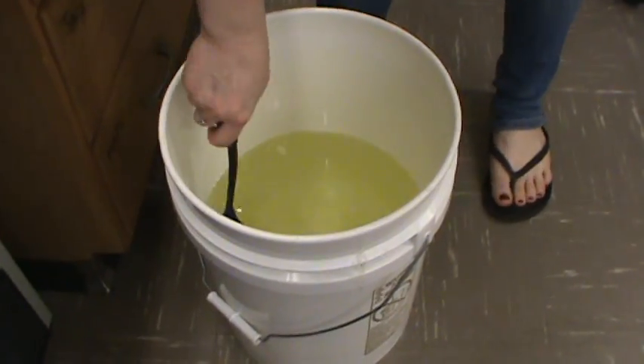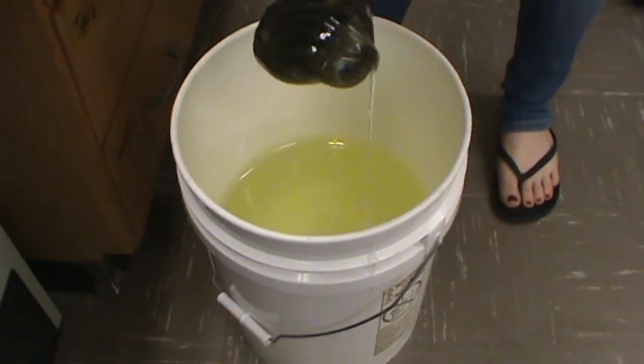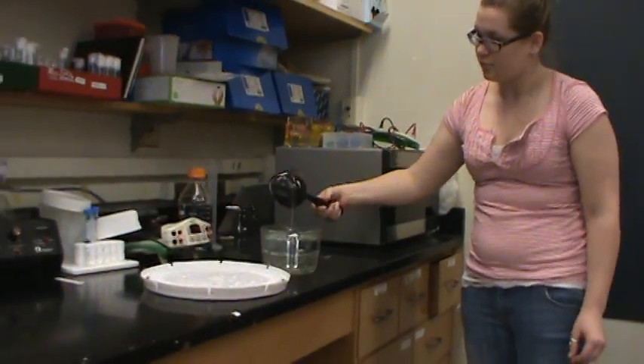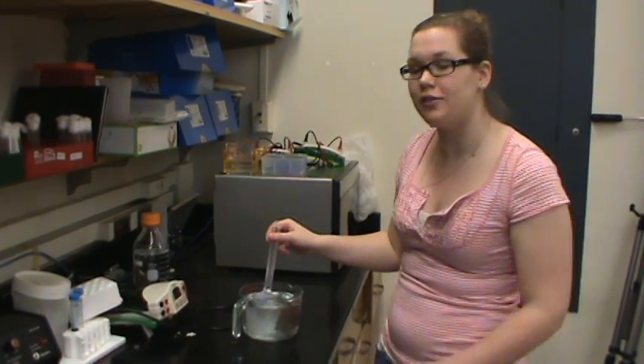Now that we've heated the water to near boiling, we'll add our 494 milliliters of corn syrup. Now that this is dissolved, we'll measure out our dry ingredients.